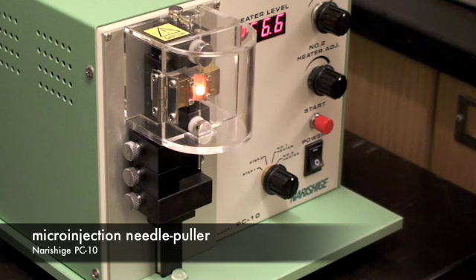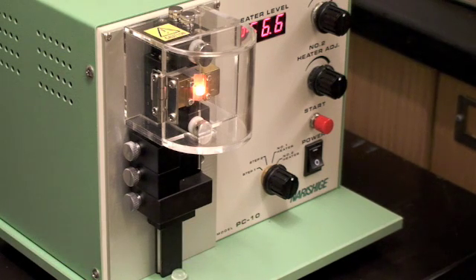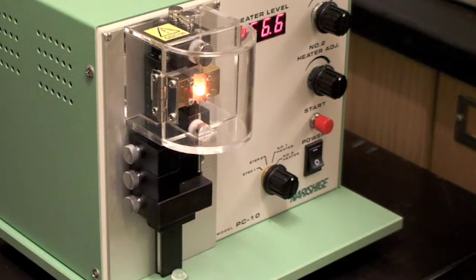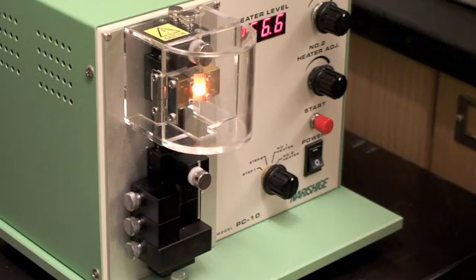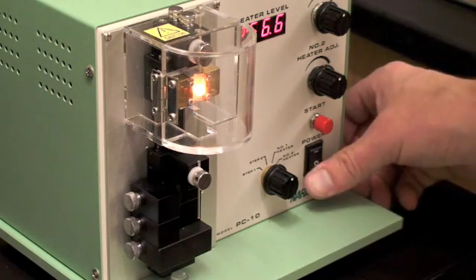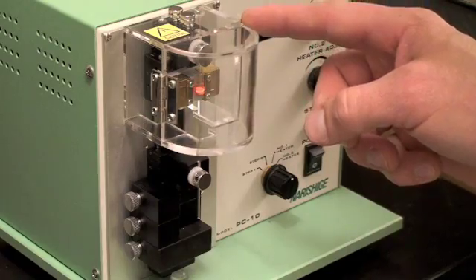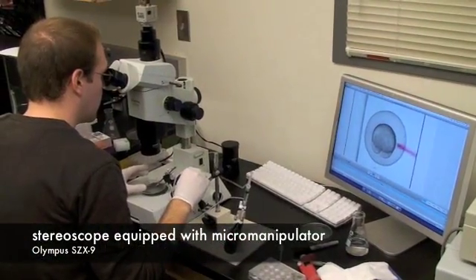Upon completion of our fluorescent transgene, we pull 10 to 15 micrometer outer diameter injection needles and isolate one to two cell stage zebrafish embryos from specially designed breeding chambers. Now comes the tricky part.